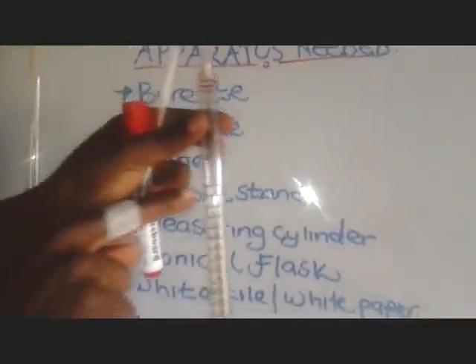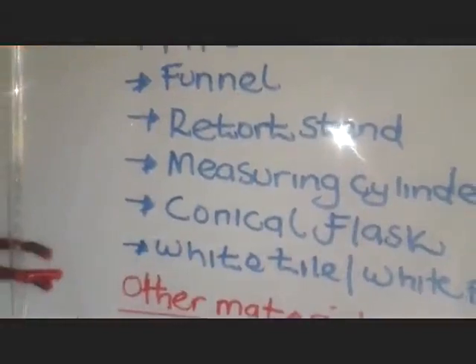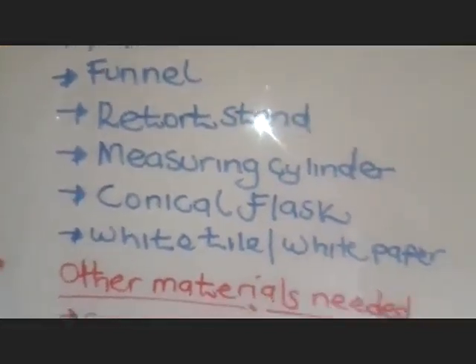This is also a pipette. However, what matters is this value here. It can be 25, it can be 20, it can be 10. But we are going to drill more on, or use more, the one of 25 and the one of 20.